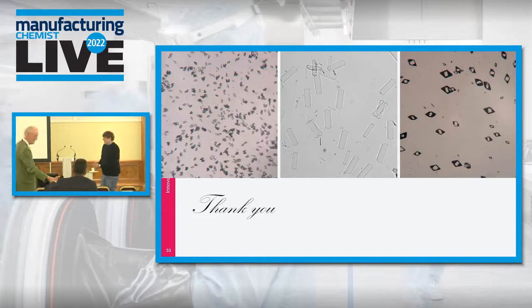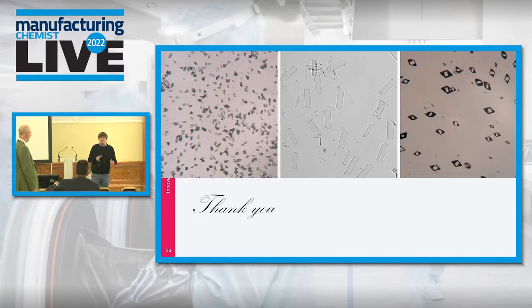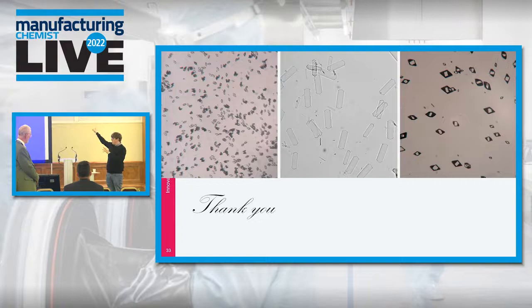We haven't tried co-crystallization, no, that is on the agenda. But what we have actually done is, and we can say this now, it's on the website, we have tried reaction chemistry using this system, where we have reagents on both sides to make a desired product. So we have actually used that to make inorganic excipients. So that's one thing we have tried. So this expands from simple API recrystallization to reaction chemistry as well.